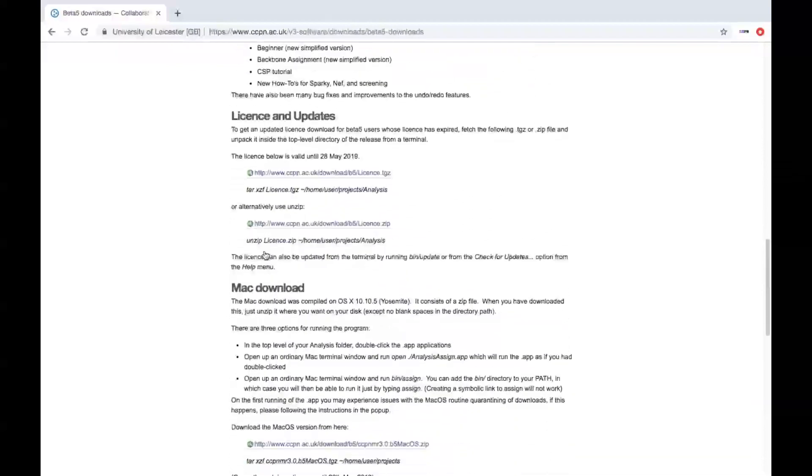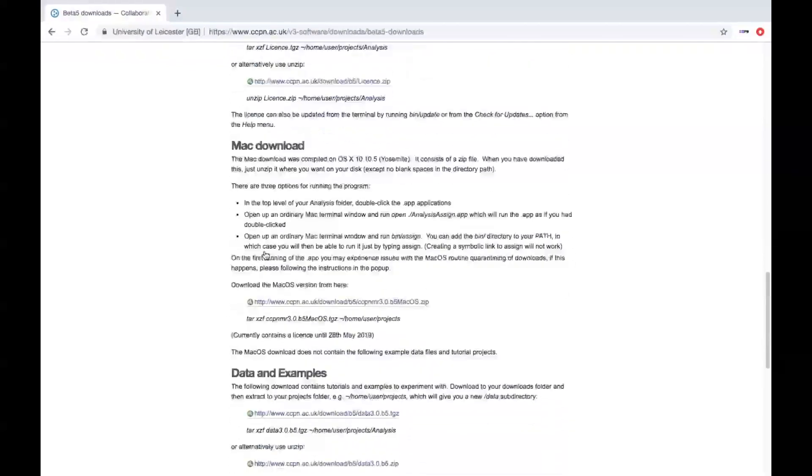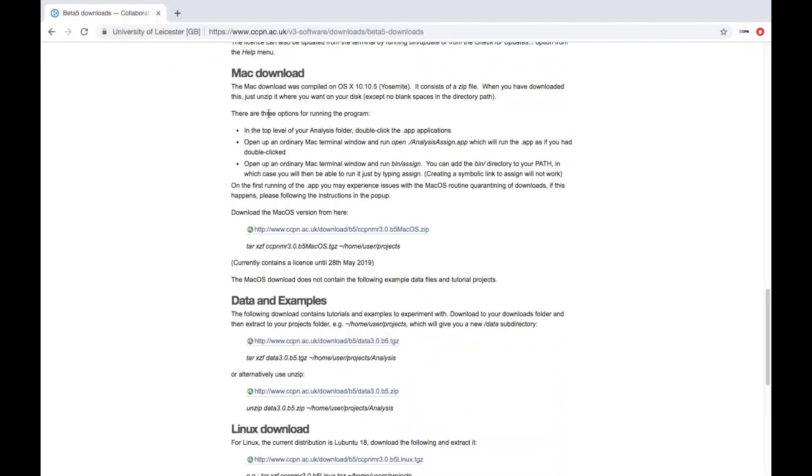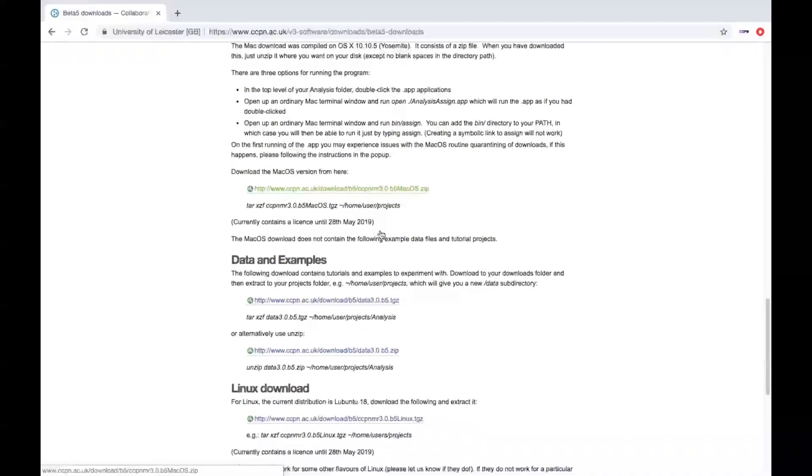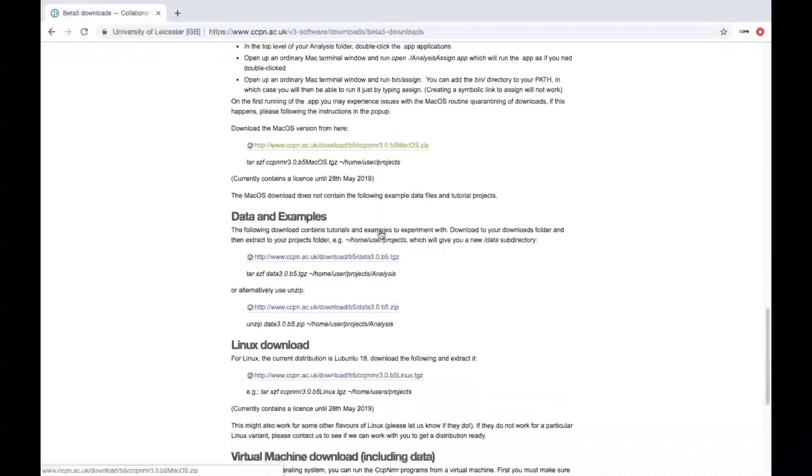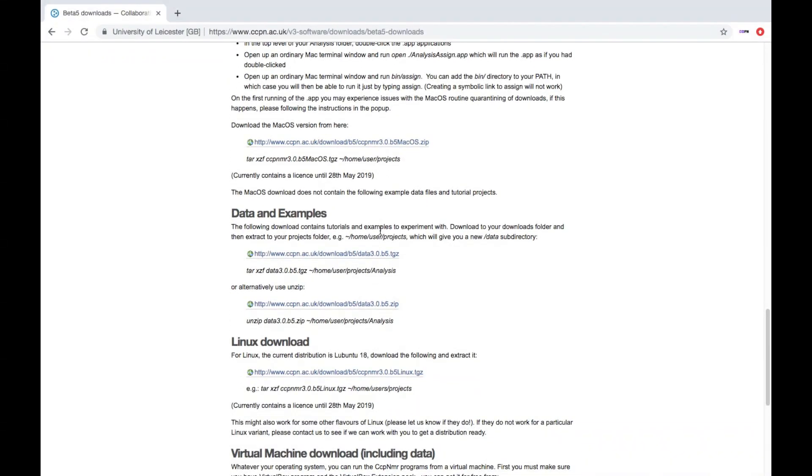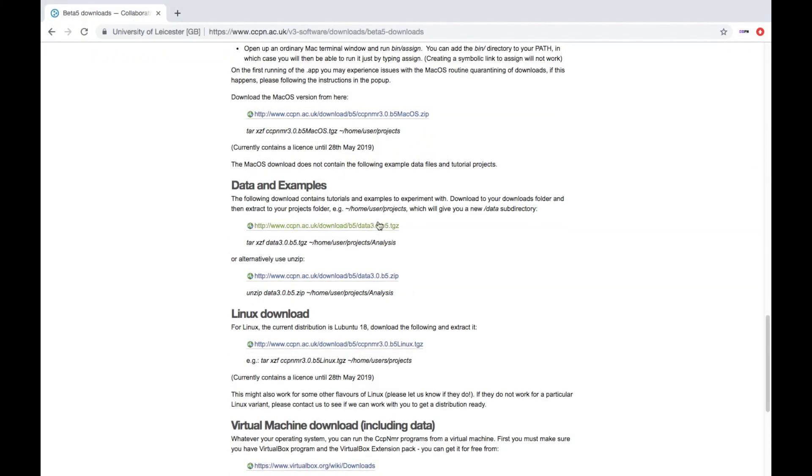As you scroll down, you will find the Mac download, which you can download by clicking on this link here. This doesn't include the tutorial data and example files. You need to download those separately with this TGZ or this zip file.